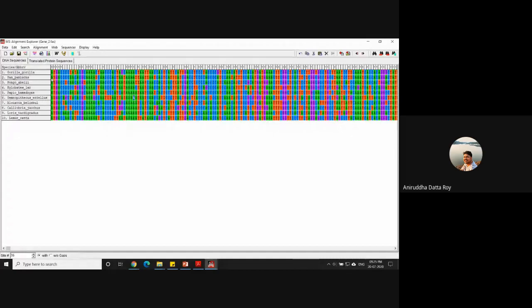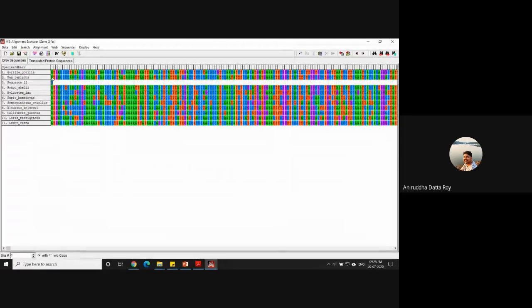And I have made a list in the previous file. My third taxon was Homo sapiens. So what I'll do is click on any base here in the beginning, and if I press Control plus N, you can actually add one more sequence. So I'm going to keep it as Homo sapiens, and here I'm just going to put a question mark.